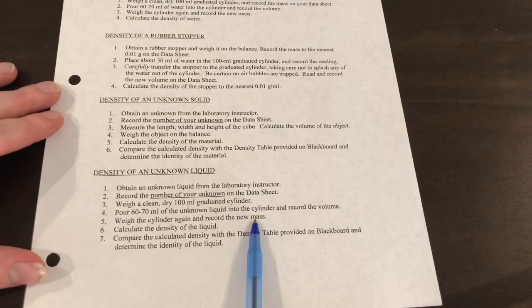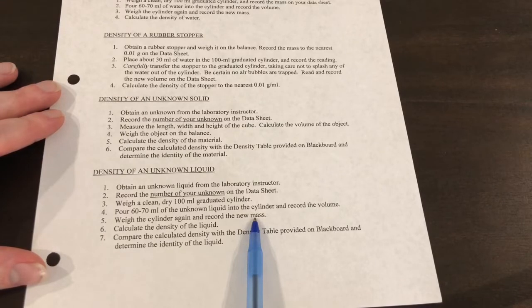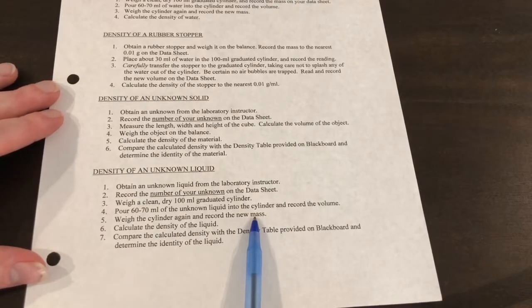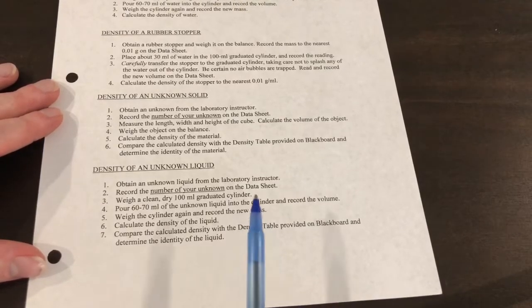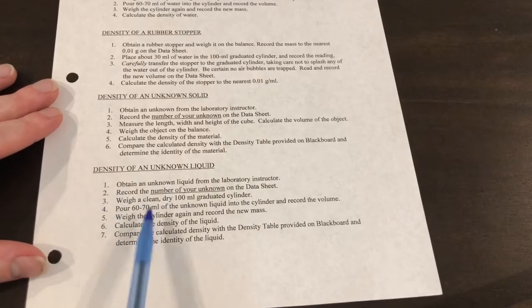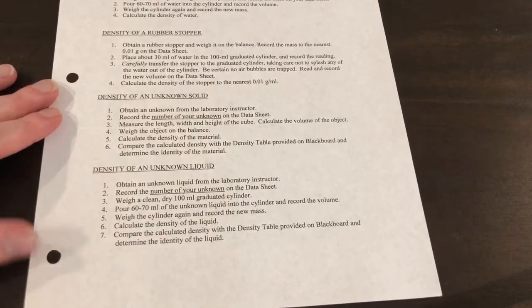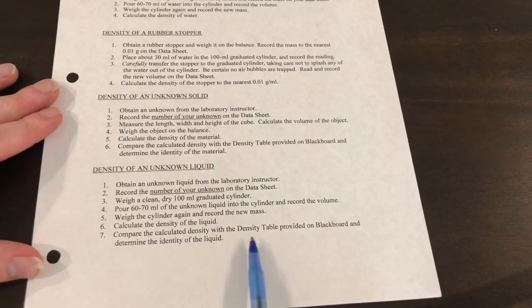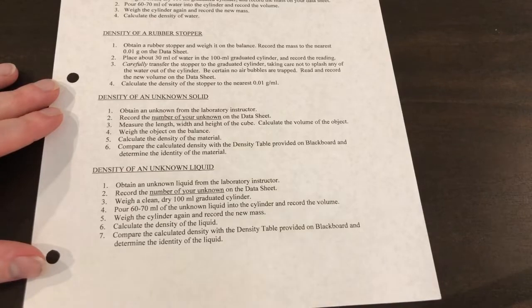What we can do is subtract to get the mass: the mass with the liquid in it minus the mass of the graduated cylinder originally. That gives the mass of the liquid. Our volume is read directly from the graduated cylinder, so we can calculate the density of the liquid. Then we compare the calculated density with the density table provided on Blackboard and determine the identity of the liquid.